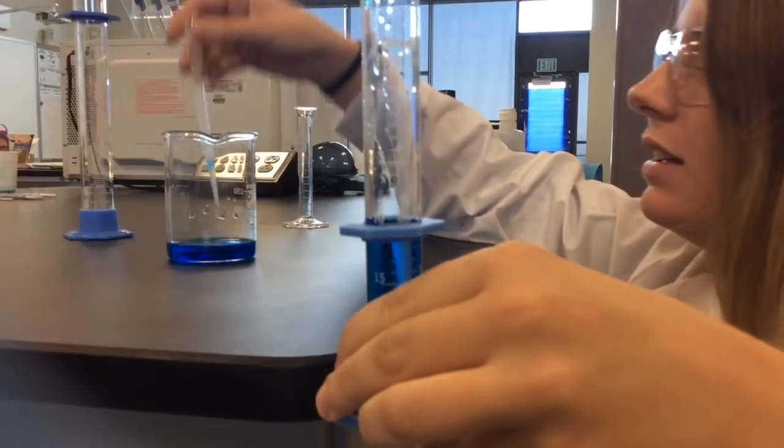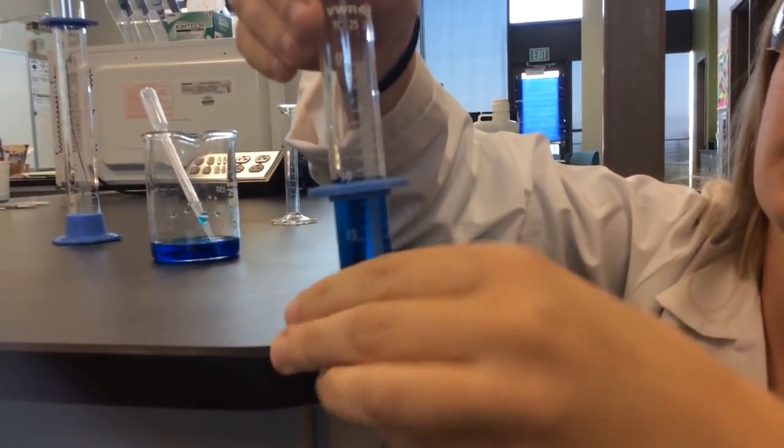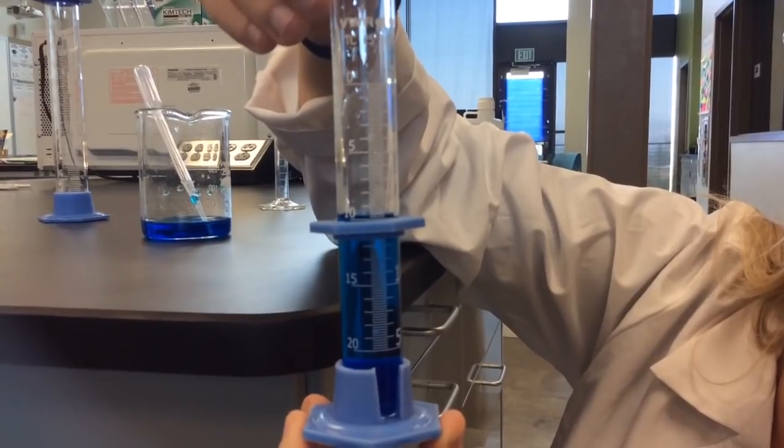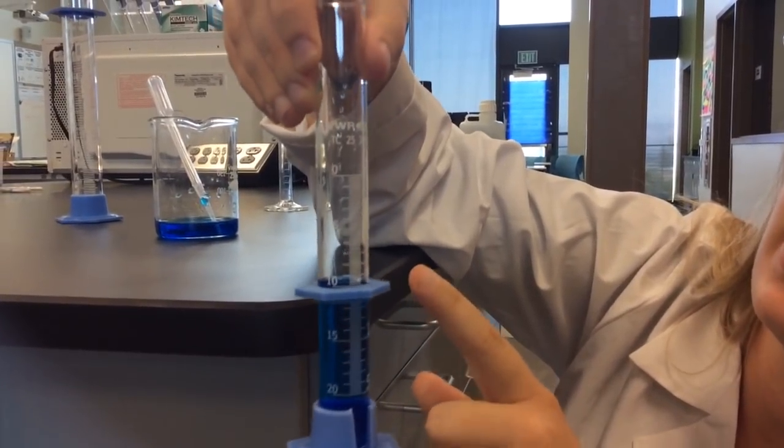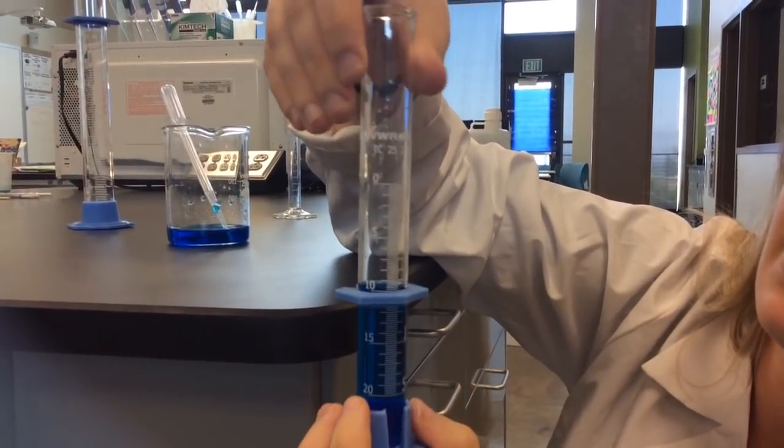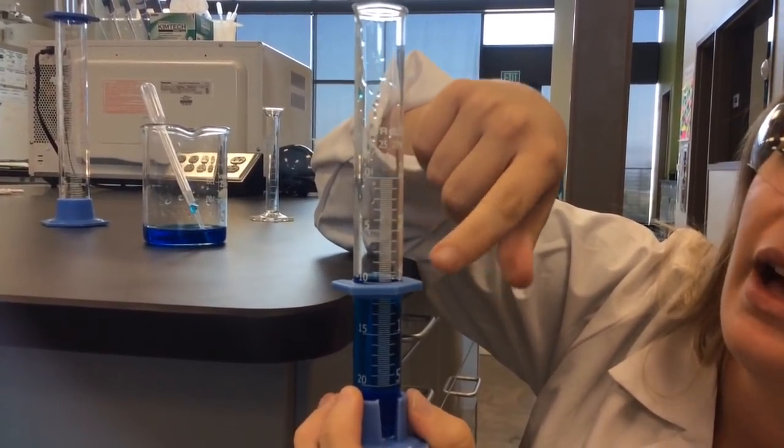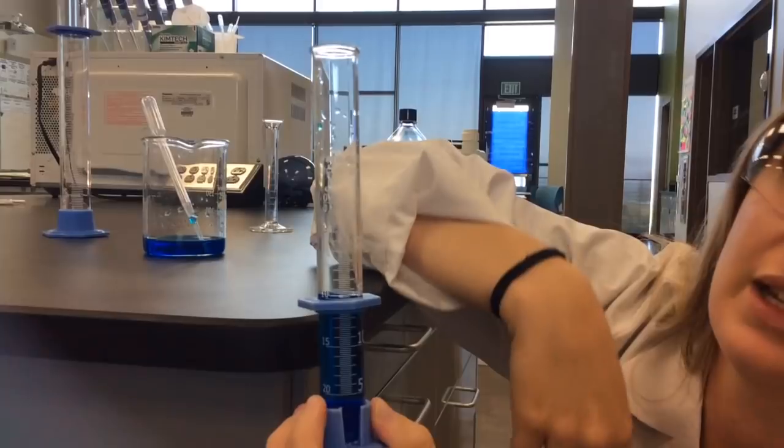And now we have maybe just one drop over, but the meniscus at the 15 milliliter mark. So make sure when you're measuring that you use the transfer pipette to get those last couple of drops so the meniscus is touching the bottom of the measurement line for 15 milliliters.